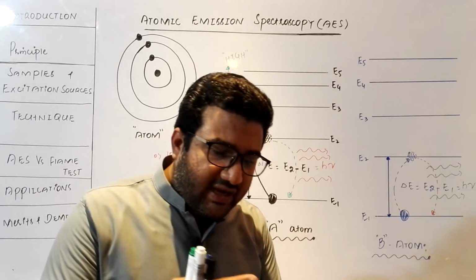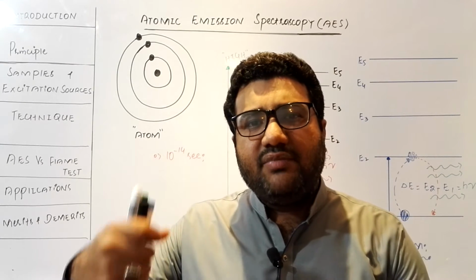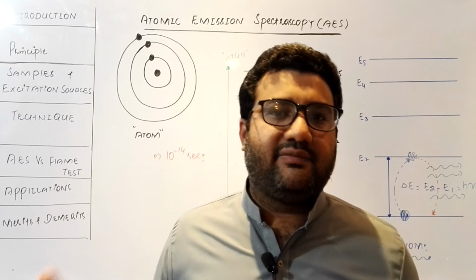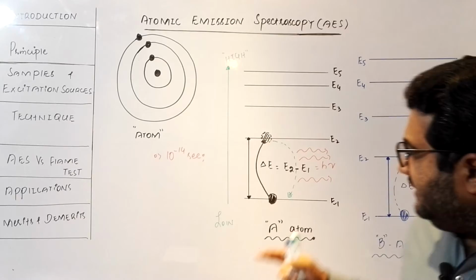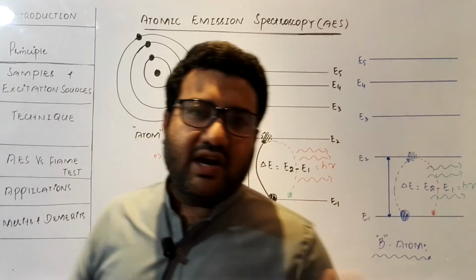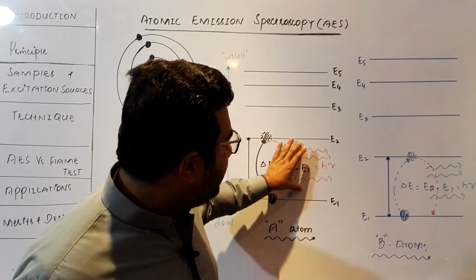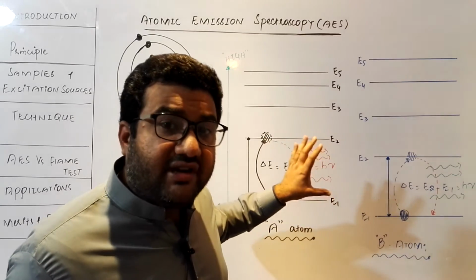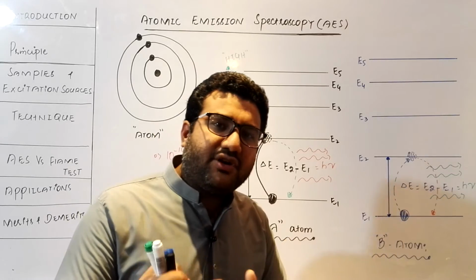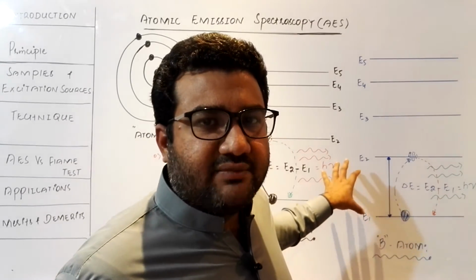Now the energy absorbed and released by an atom of one element will be different from the energy absorbed and released by atoms of all other elements. So in this case, these emitted photons will be a characteristic feature of every atom, different from all other atoms. And when these emitted photons are observed and studied using an emission spectrometer, the emission spectrometer will make an emission spectrum with the help of these emitted photons.